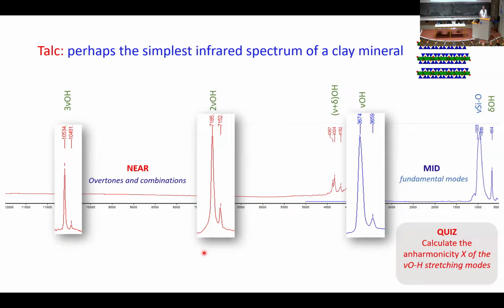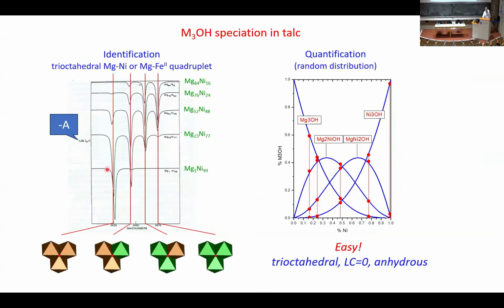Very common in nature. And if you increase the amount of divalent substitution, we are not generating charge, we are staying divalent against another divalent, then you can produce spectra like this. Now, this is another format where the peaks look down. We'll discuss about things later. So, you see magnesium and nickel here, that's from a work of Ito in the 70s. Different ratios of magnesium and nickel producing talc containing magnesium and nickel and producing the spectral sequence that you see over there.